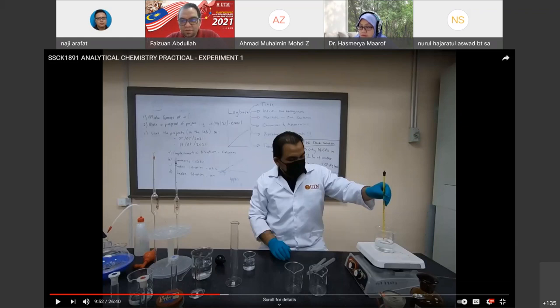Bupa, are you here? No, okay, Bupa. Why not? Can you explain why I can't stir the solution using the mercury thermometer? Do you know why, or you don't know? You can just say you don't know. The mercury will react. You mean that the glass bulb that contains mercury will break.